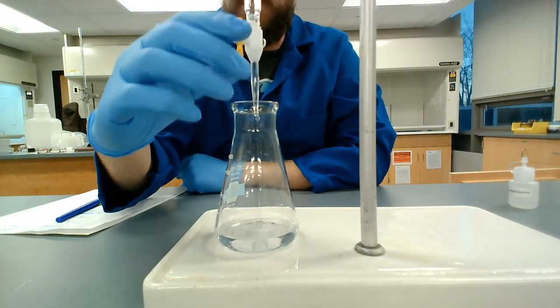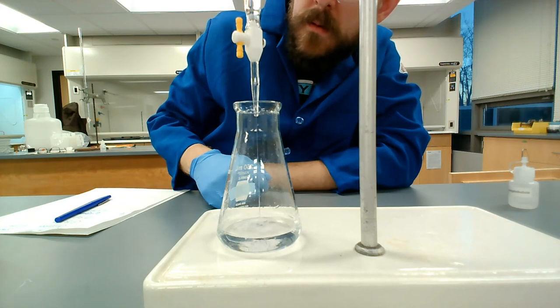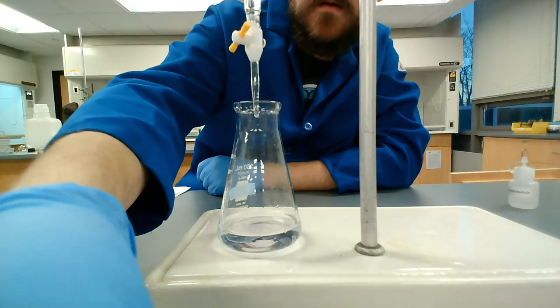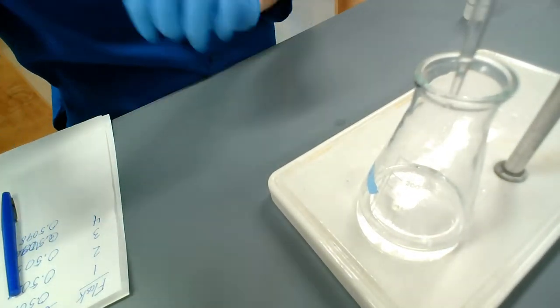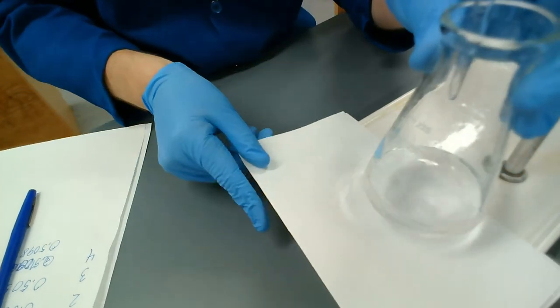So now I'm going to open the stopcock all the way up. You can see a straight stream of liquid plunging into the bottom. You can start to see a little bit of pink pool forming where it's dropping, so I'm going to slow it down and close it here. I'm trying to mess with the camera. I realize it's very hard to see this pink. It's a very, very faint pink color that you are shooting for.